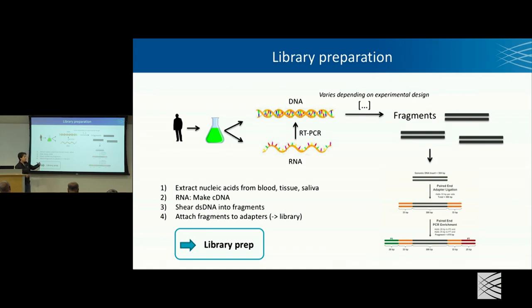When we're talking about sequencing data, where does it come from? Well, typically, you get some kind of biological sample from your study participants or organism of choice. You extract DNA or RNA and then convert it by RT-PCR to complementary DNA if you're doing classic RNA-seq. There's a lot of variation in the specific ways of preparing this. But the commonality is that you're generating short double-stranded DNA fragments, and you do some preparation steps, binding adapters, barcoding, and things like that, that allow you to recognize where the sequence came from once you've sequenced it.